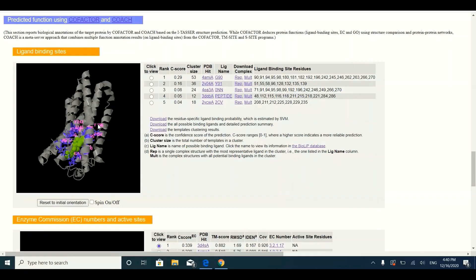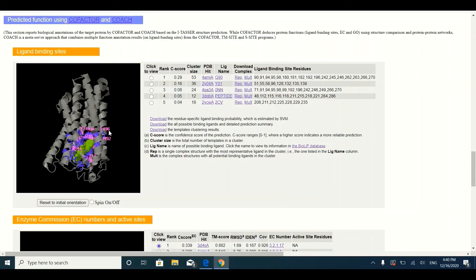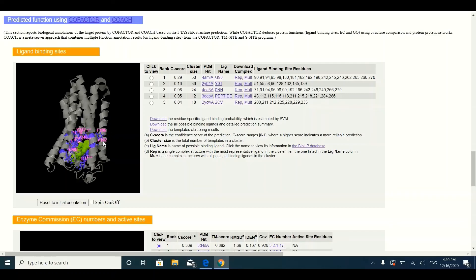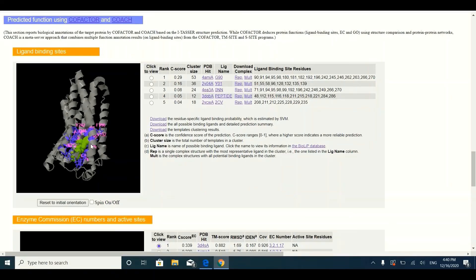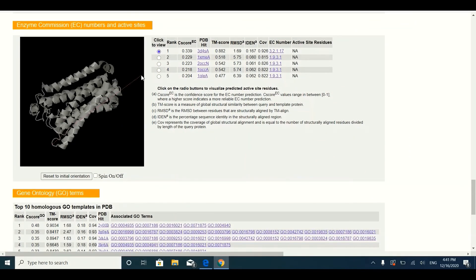Below the alignment section, you will find information about ligand binding sites potentially present in your three-dimensional protein structure. In the three-dimensional view, pink highlights indicate ligand binding site residues — for example, phenylalanine 196 could be potentially involved in ligand binding. This information is fetched from the templates used for developing the structure. Below this, you will find enzyme active sites — if your protein is an enzyme, you can identify which residues form the active site, again based on information from the templates.